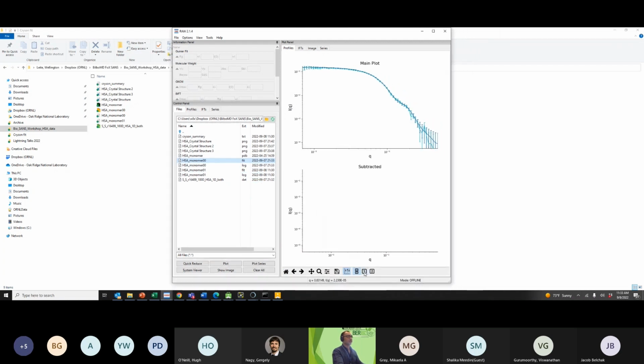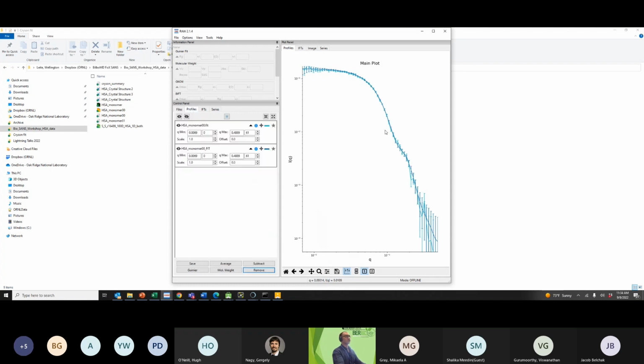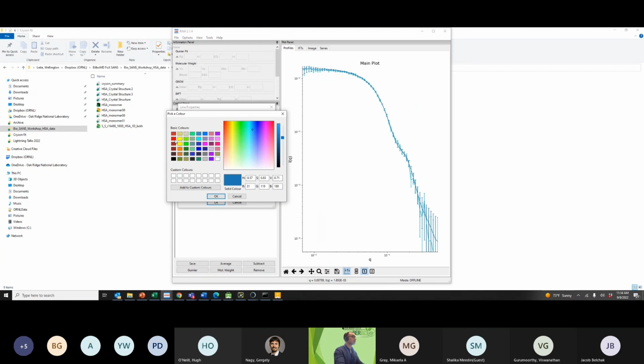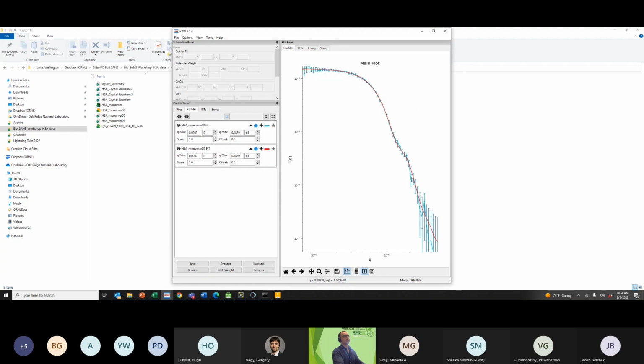Okay, so if I use the second window here, I have my entire fitting there. You can see the blue data is my experimental data, and no, sorry, okay, let me change the fitting to something red. Yeah. So my fitting is the red curve, and my experimental data is the blue curve. You can see there is a very nice agreement between both, right?